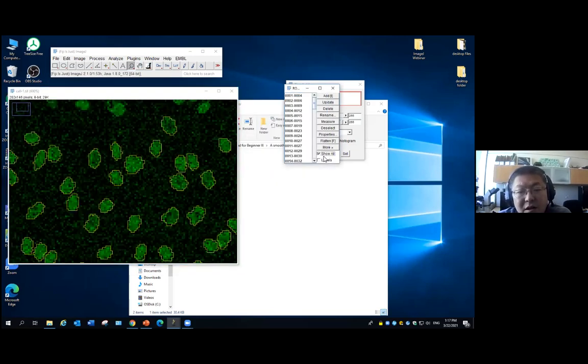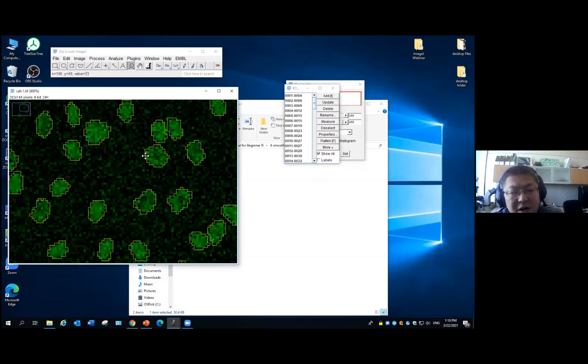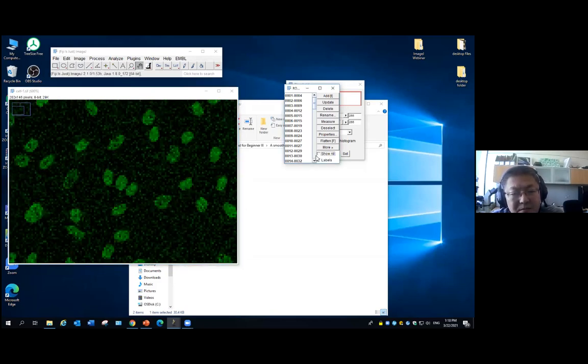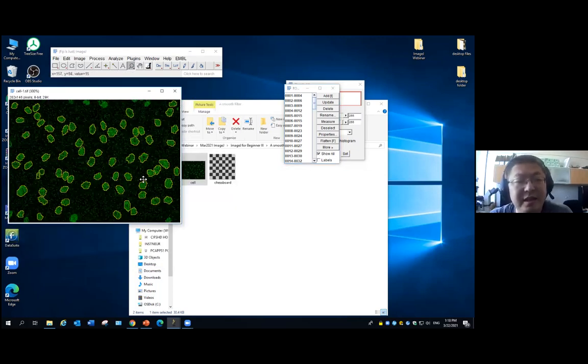So I will say, it depends on personal choice. I'm quite happy with this. I know my raw data is not specifically very good data, and I don't actually do much. I only go through a mean filter with the radius as 1. Then I feel I get a quite good selection on all those things, except for maybe this one. This I think is one cell, but somehow here the watershed cut it off. Okay. You can try if you use the median or Gaussian blur, if this can give you one. But for me, I would say generally, for this data, I'm fine with it.